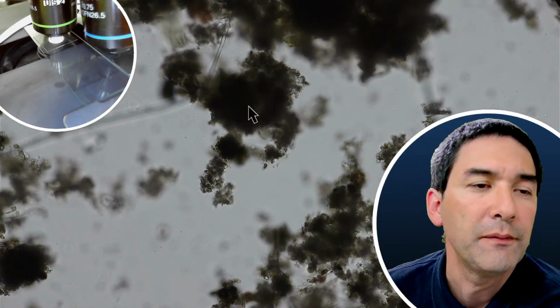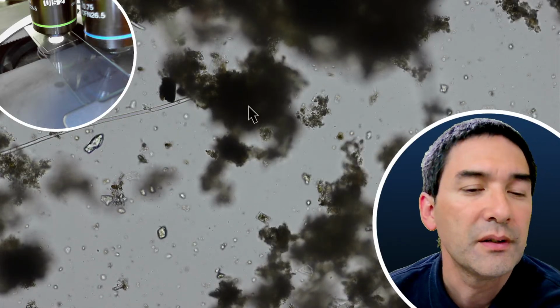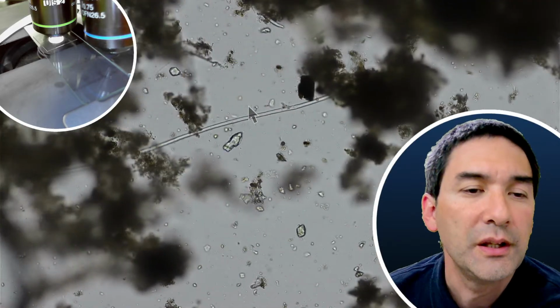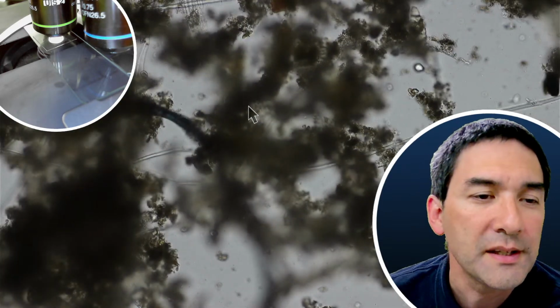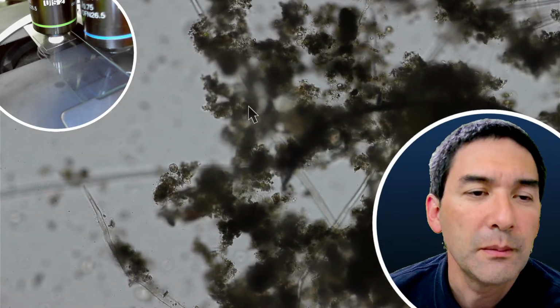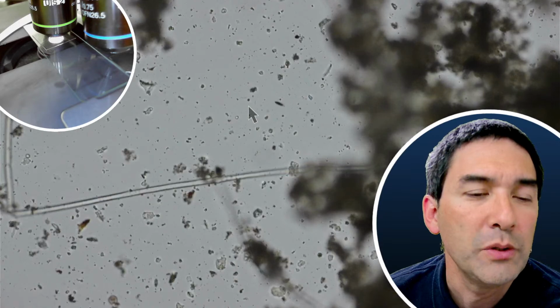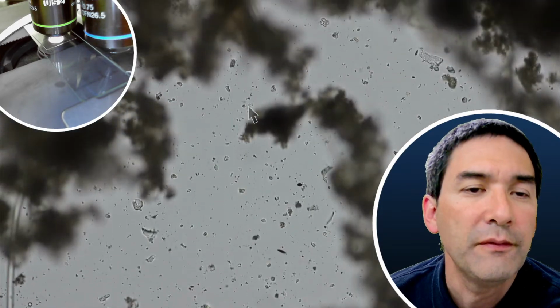So for example, I found some algae today in the morning, on my other slide, because they are green, with the green chloroplasts. This basically means that sometimes the natural colors are an advantage, because this way you're able to identify certain structures better.